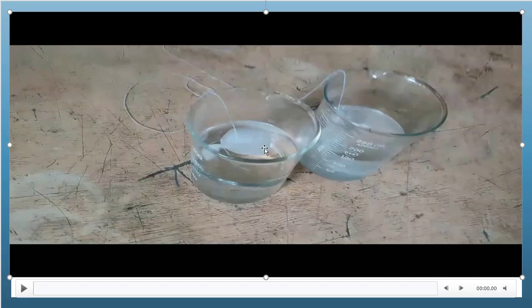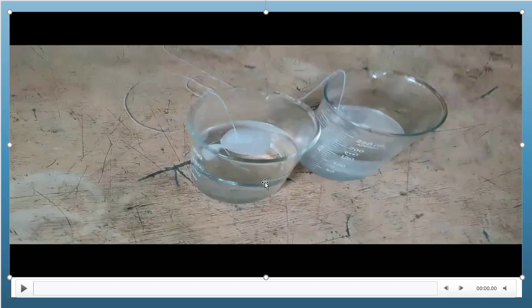In the second beaker, water also moved from lower concentration to higher concentration. In the first beaker, water moved from the beaker into the egg membrane — that is water moving into cells — so endosmosis occurred. In the second case, water moved from inside the pouch to outside, so exosmosis occurred. Recall the first question: how do shrunken vegetables become swollen when kept in water? Water moved into the vegetables, making them swell — that means endosmosis occurred.